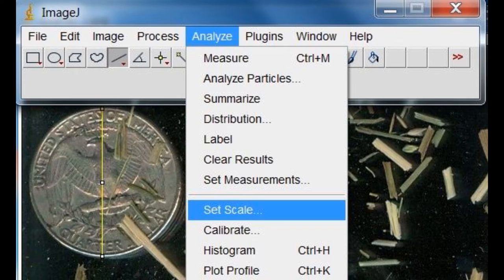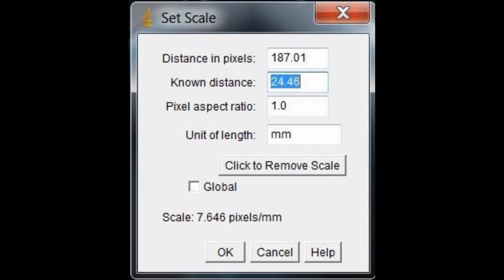Then click Analyze, Set Scale. Keep the distance in pixels the same. This is the length of your drawn line. The known distance of the line should be 24.46 millimeters. Keep the pixel ratio at 1, and the unit length should be millimeters.